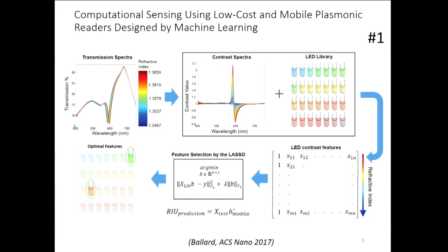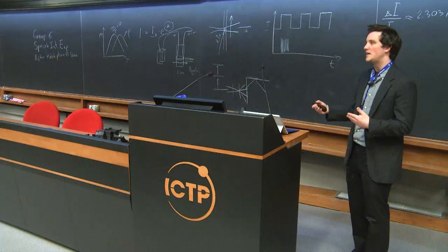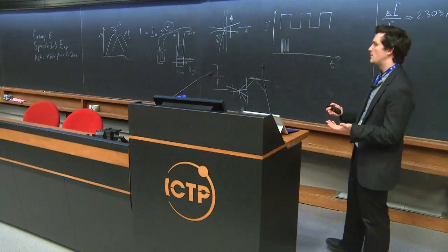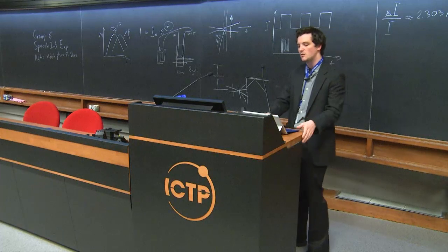I won't go into all the details, but basically we used machine learning techniques, as I've discussed before, to select the optimal LEDs to use in this design from a larger library online. So there are thousands and thousands of LEDs online that you can order. And it's hard when you're engineering a system like this to know exactly which LEDs would be the most optimal, given a specific plasmonic sensor design and an inherent fabrication variability. So this framework takes into account the fabrication variability and the specific plasmon resonance to actually select the optimal LEDs that can be embedded in a modular way into the sensor.